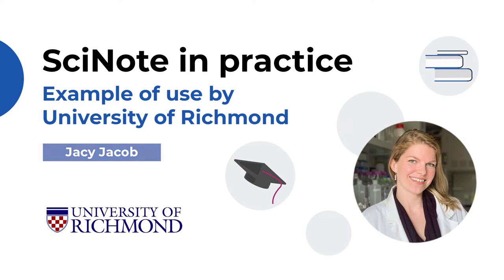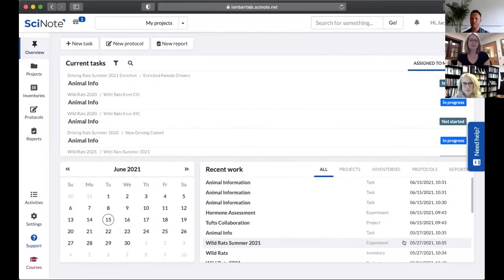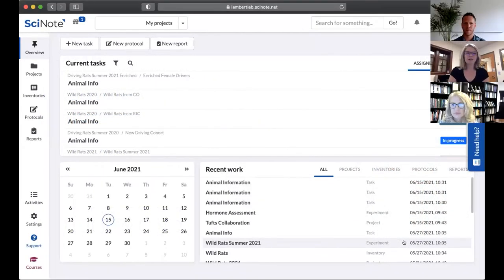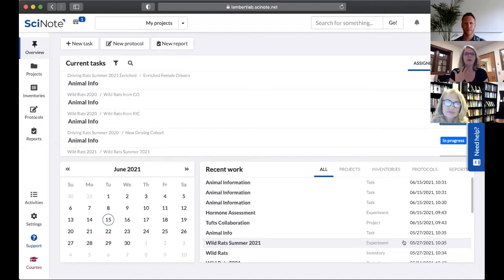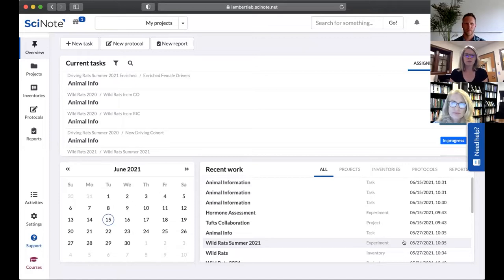So I'm going to go live here and share our actual SciNote page. If you're already a user, this should look familiar. But if you're not, this is the overview page.